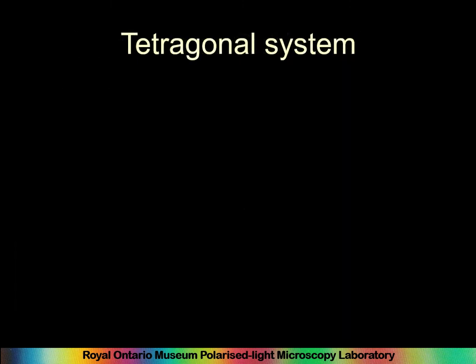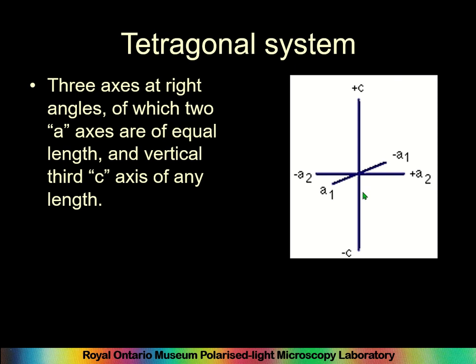The tetragonal system is the next one. So as you can imagine, you have 2 axes which are the same, and one which is longer. And what we will do is say the one which is longer than the other 2, we shall call the c-axis. Axis, not the axes, the axis. And so the c-axis is probably the one thing I will want you to take away from this, because it can be very important. Sometimes it can be longer, sometimes it can be shorter, sometimes it can be exactly the same length.